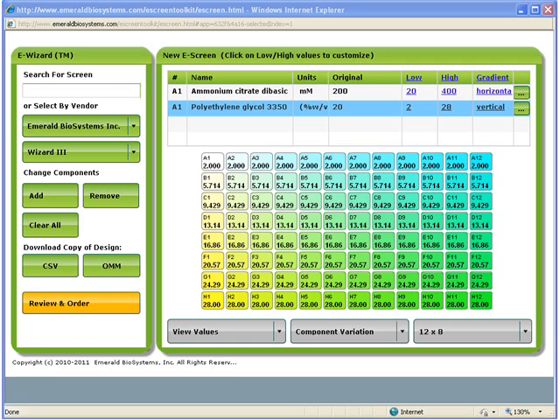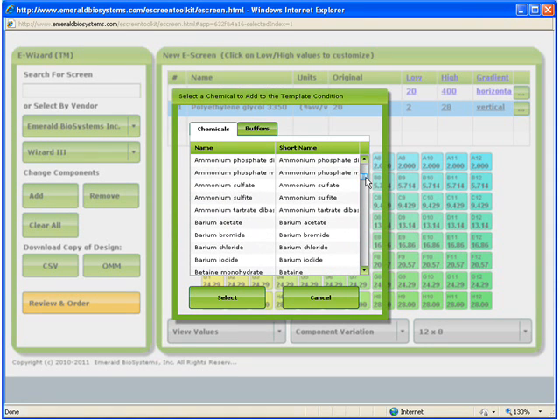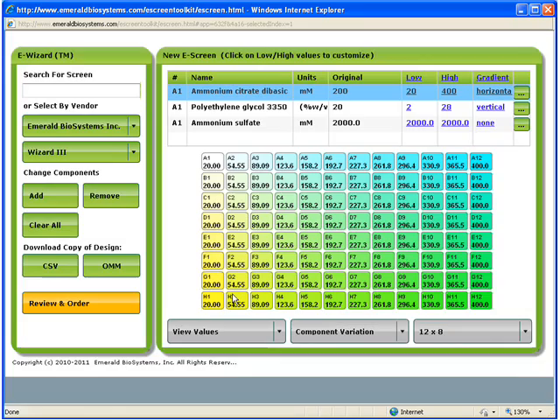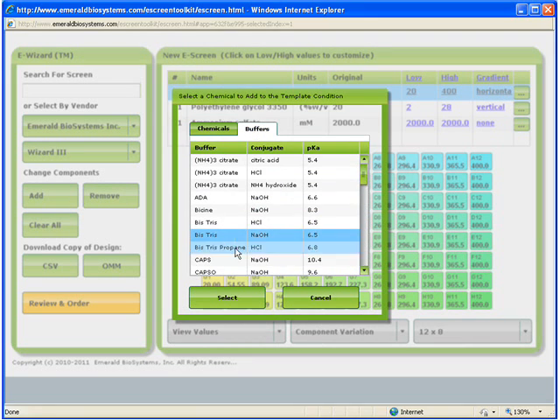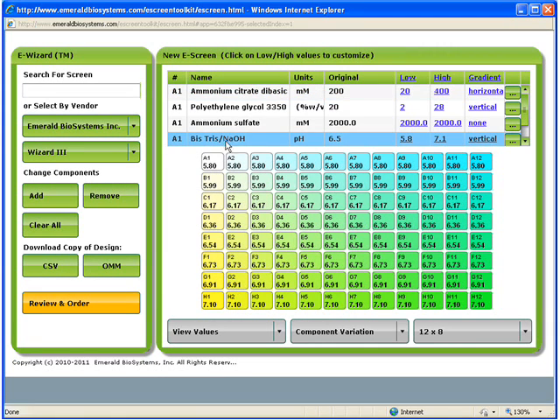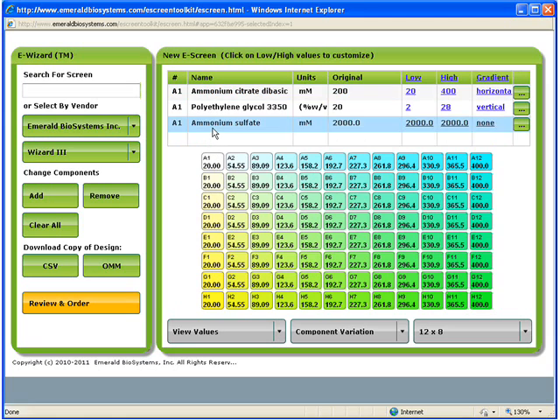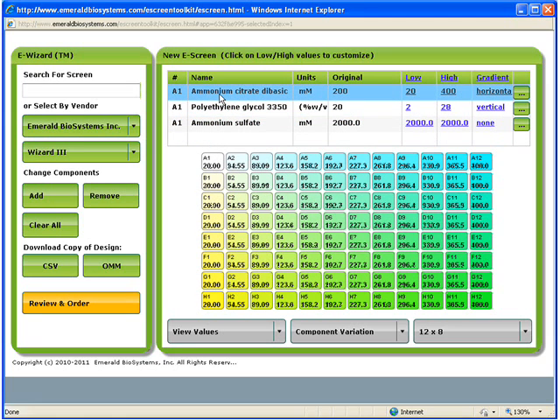The Add button allows you to add a custom solution from a large database of chemicals and buffers. Simply select the desired chemical or buffer and click Select to add it to your formulation. Similarly, the Remove and Clear All buttons allow you to eliminate solutions from your formulation. These functions, along with the built-in database, allow the user to create a screen from any combination of chemicals, even if your starting condition is not based on a commercial screen.